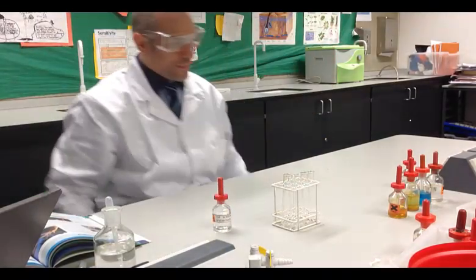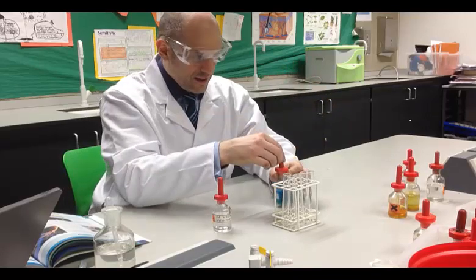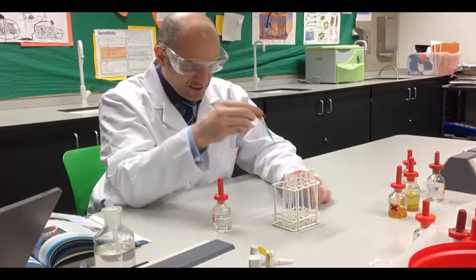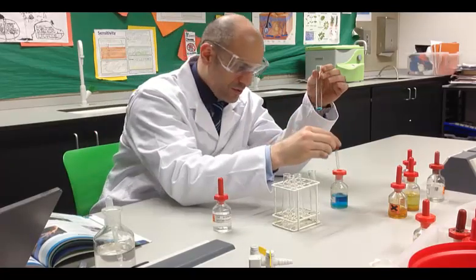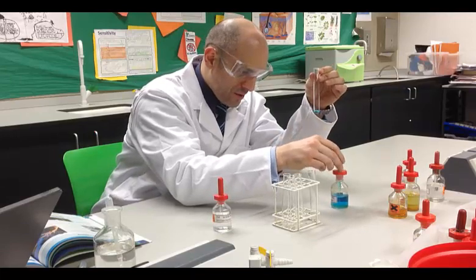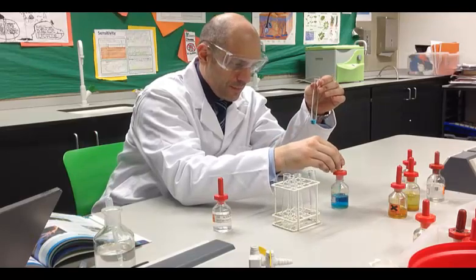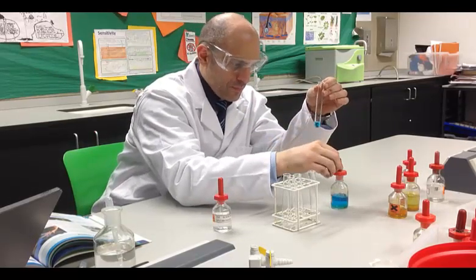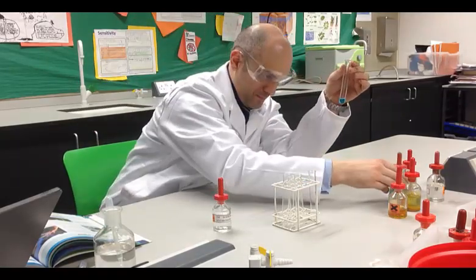Next up, copper 2 sulfate. Now, these solutions are quite clear, well, all except the iron 2, so I'm not going to add the acid so as not to dilute the solution. Notice how copper 2 is a beautiful, bright blue colour. Okay, copper 2 ions are bright blue.